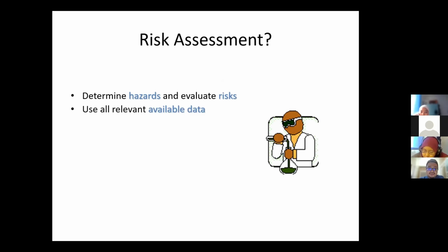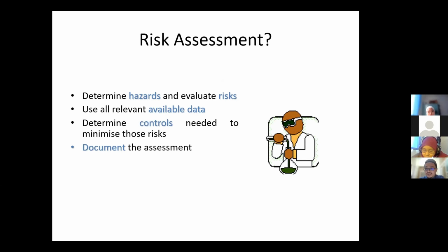Use all relevant available data. So that's how we do our risk assessment. Determine controls needed to minimize those risks. Farhana, you don't have to take note, just listen. Okay, semua nanti saya bagi ni. Also, the risk assessment will involve documentation. This documentation is everything. Okay, and it must agree with the supervisor or the one who does the auditing.